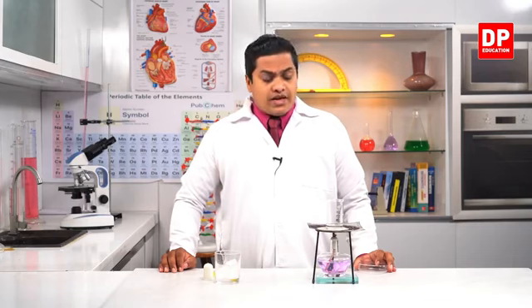Or in normal terms we refer to it as melting. So here we have melted solid wax into liquid wax, and ice also we have melted into liquid water.